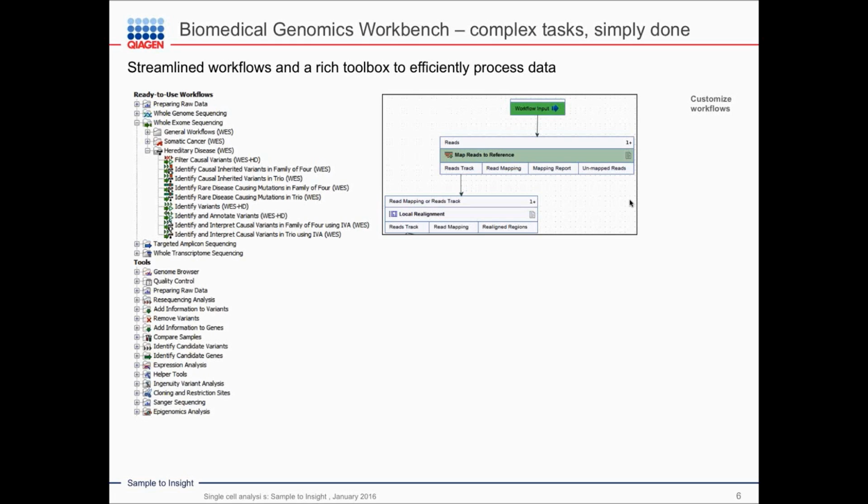And this is in direct contrast with the multiple displacement amplification on which the REPLI-g system is based. In this case, you are starting with a random hexamer followed by strand displacement synthesis with a phi29 polymerase. This has no problems with the branched DNA structures that it creates and is able to generate fragments that are over 100 kb in length.